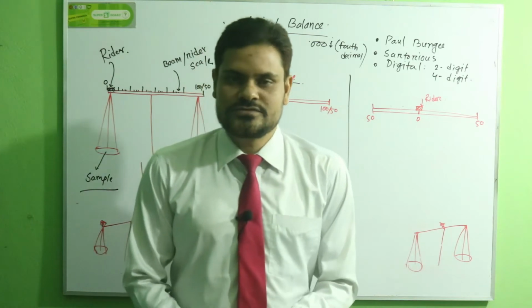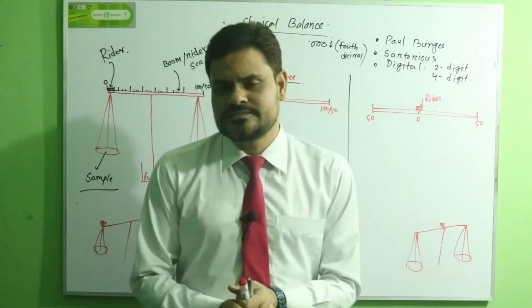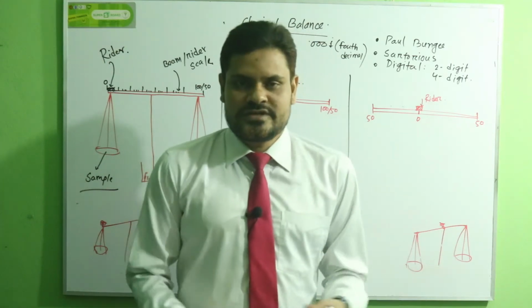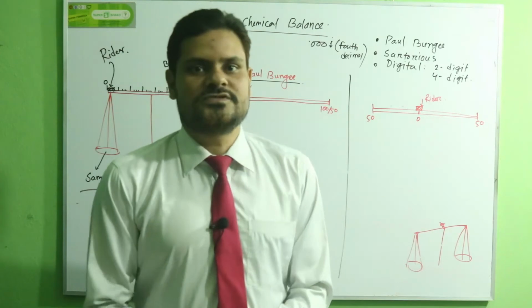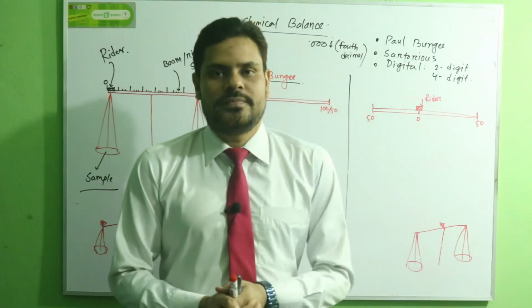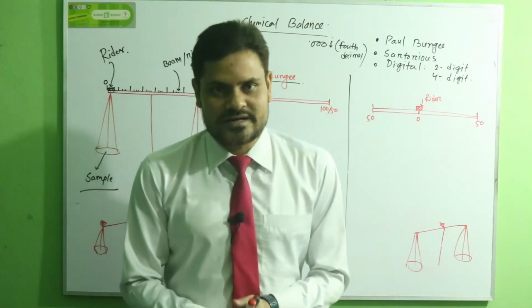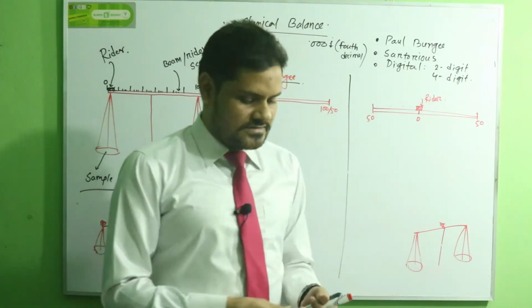Today I want to talk about the chemical balance. In our laboratory, for different purposes, we want to measure chemical substances. If we want to measure a chemical substance, we use a balance. This is the chemical balance. And there are also three types of chemical balance.